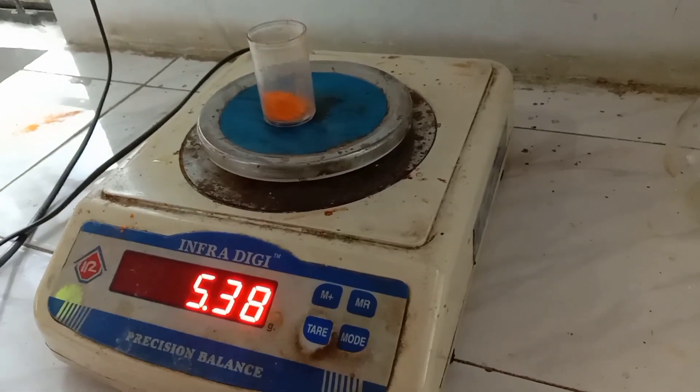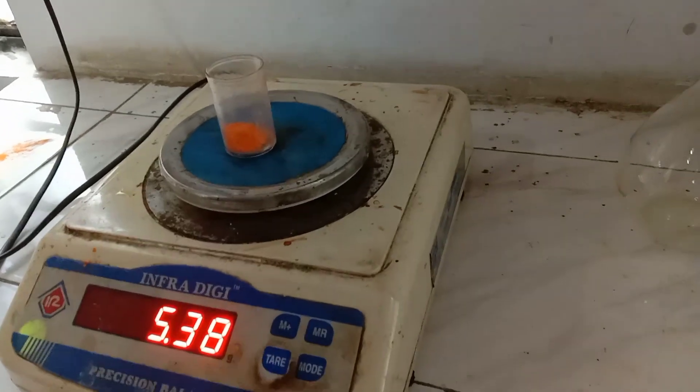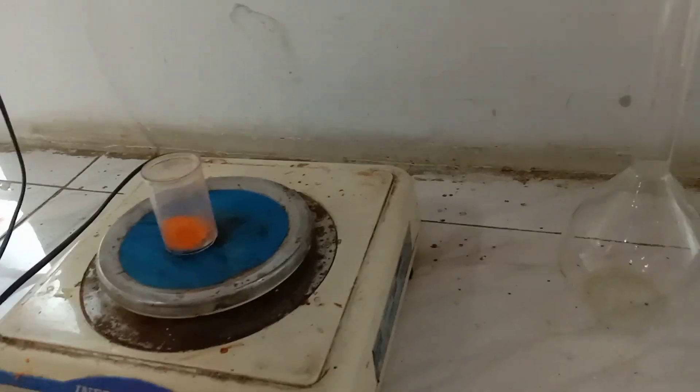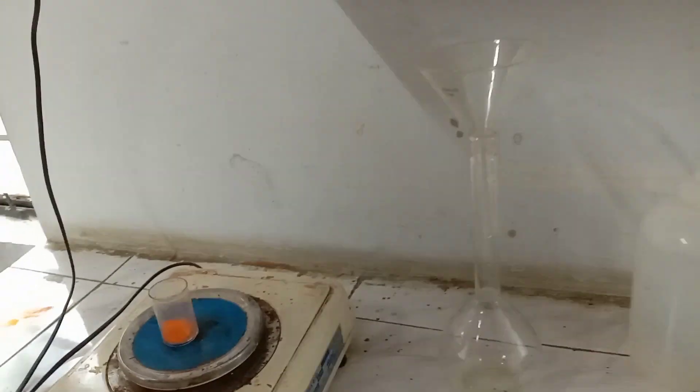W2, weight of the bottle plus substance: 5.38 grams. After weighing the substance, we transfer it into a volumetric flask — a 250 ml volumetric flask.